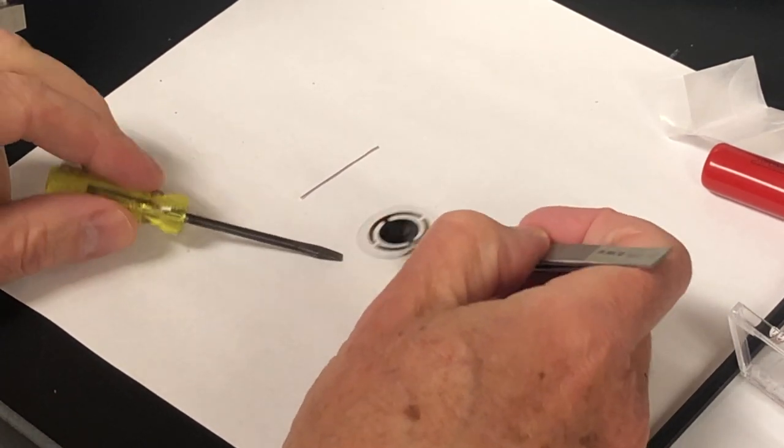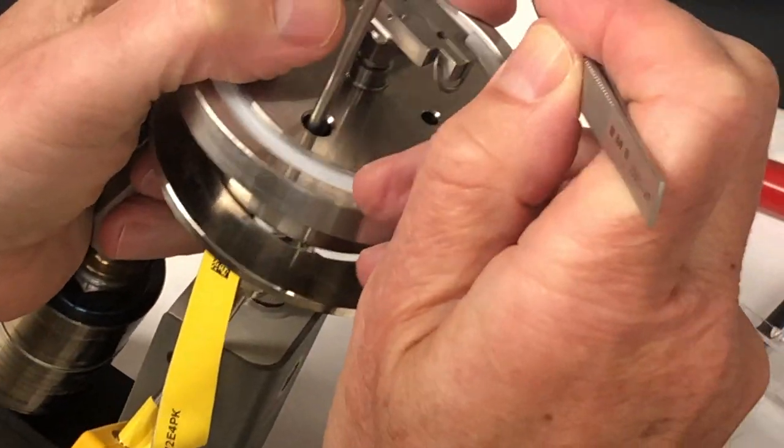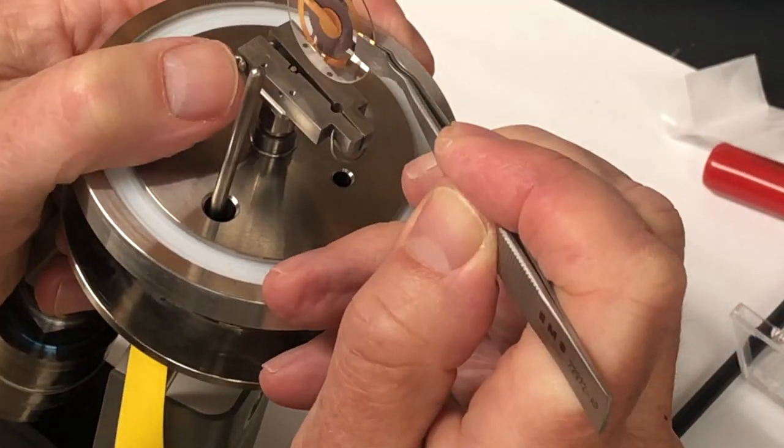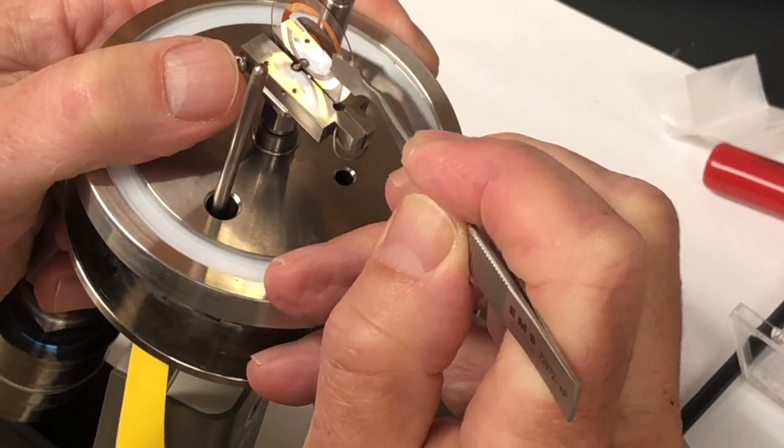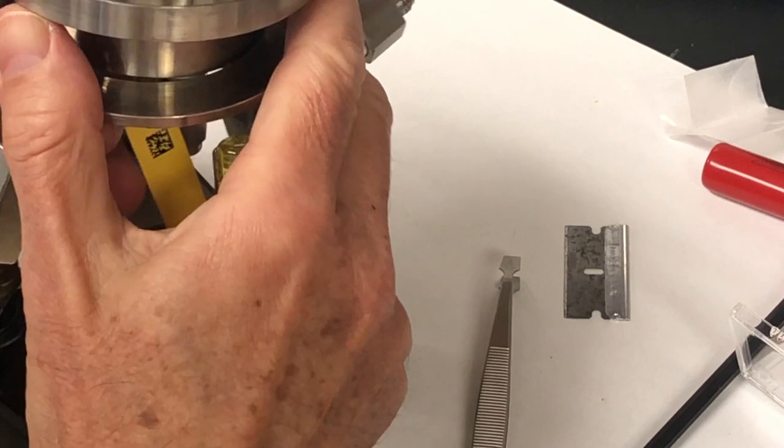And now we carefully pick up the crystal with tweezers and place it into the adapter so that one side of the electrode aligns with the wire and the other side aligns with the ground connection.